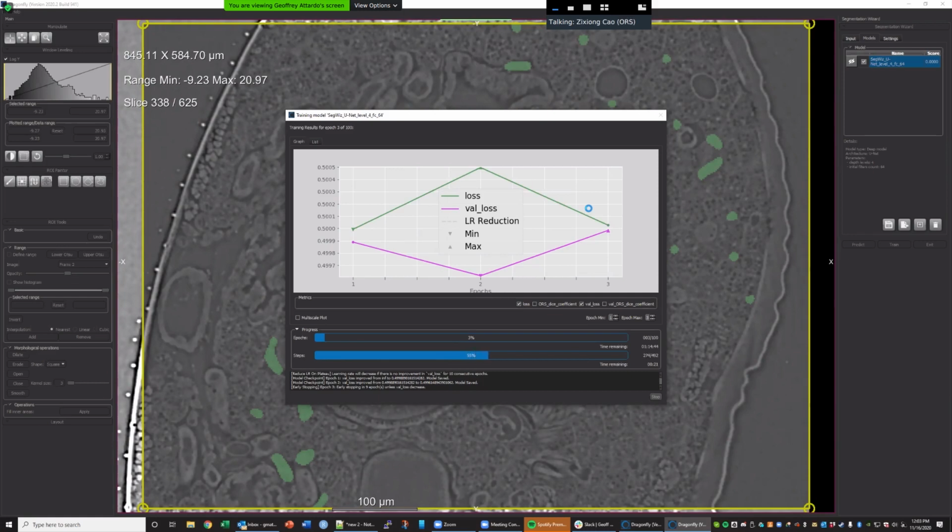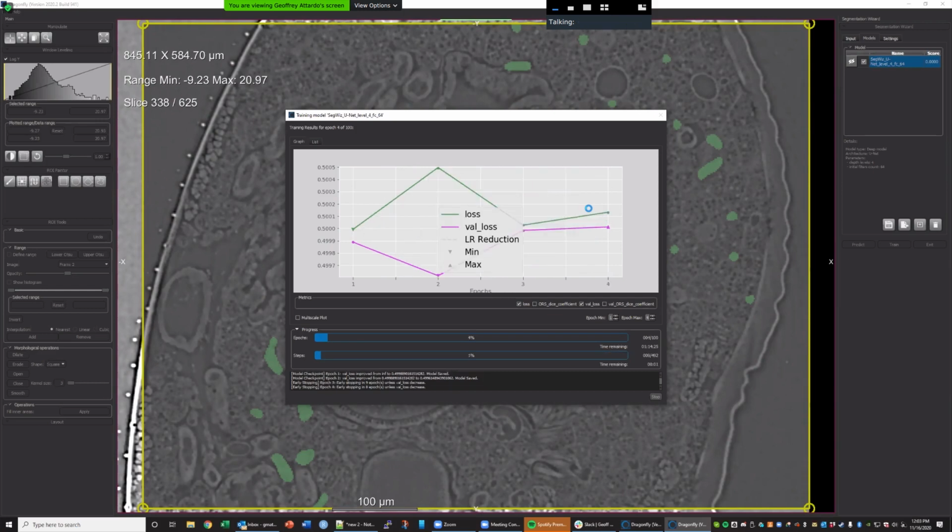If it takes 100 epochs to see the decrease, that sounds abnormal to me, because I never had that. I have some cases that it never worked. It never got a good training model to predict something. In that case, it never decreased even after 100 epochs.